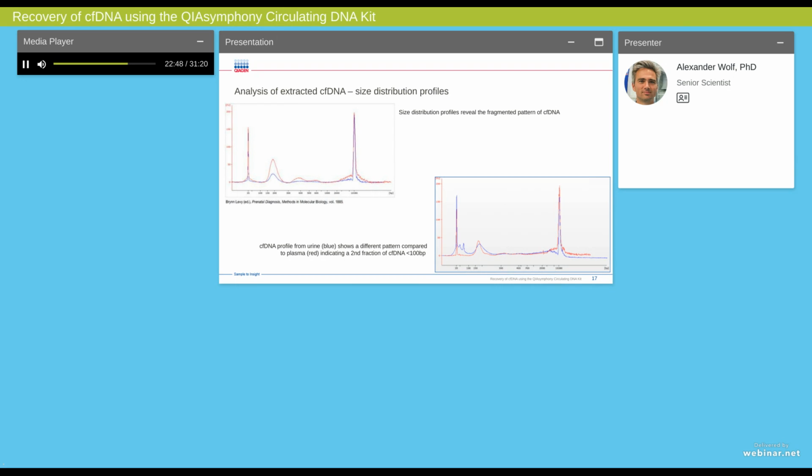This shall give you a first example of the bias each analysis or quantification method has, hardly avoidable due to the low concentrations of cell-free DNA, which makes direct and easy quantification not possible, and therefore results in only a limited number of analysis methods available.